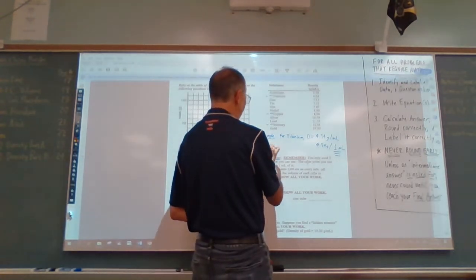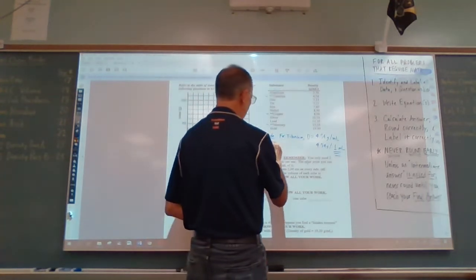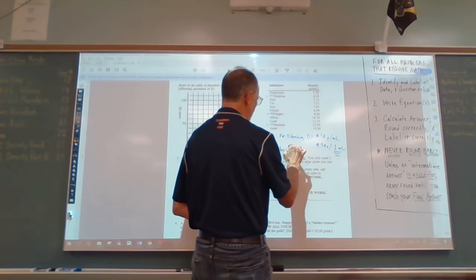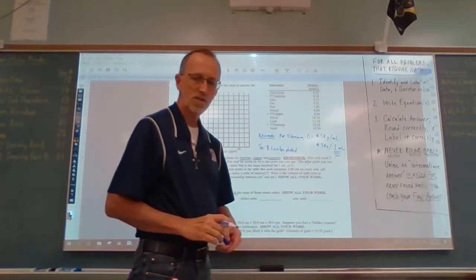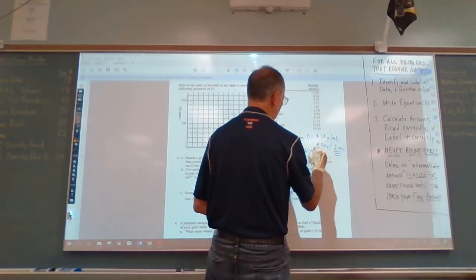So, how does that help us here with plotting a graph? So the density can actually be plotted. We can use that as a density point at 1 ml.